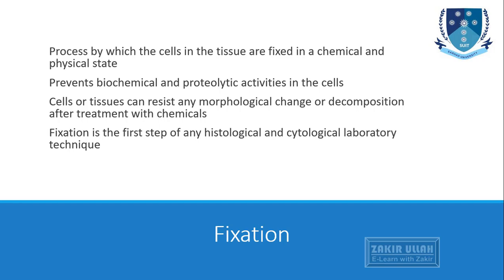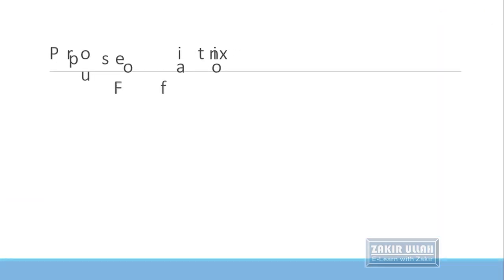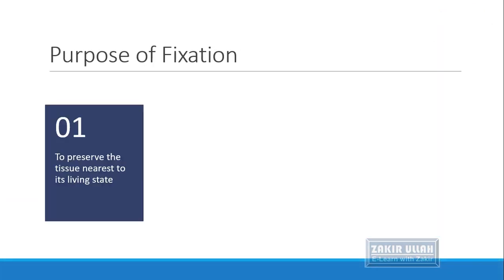And it is the first step of any histological or cytological technique in a histopathological laboratory, and it helps to maintain the tissues to the nearest of their original condition in the living system. The purpose of fixation is to preserve the tissue nearest to the living state and its original state.